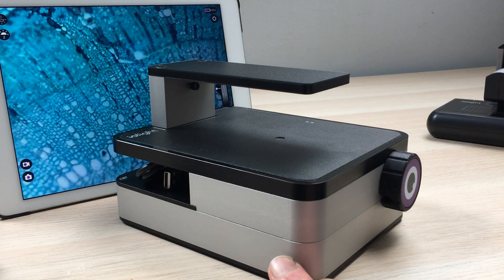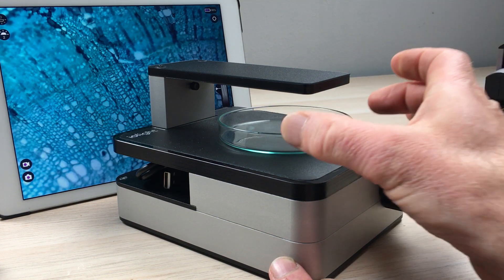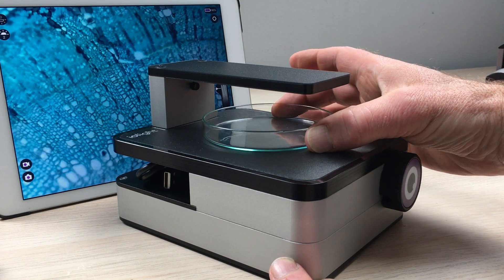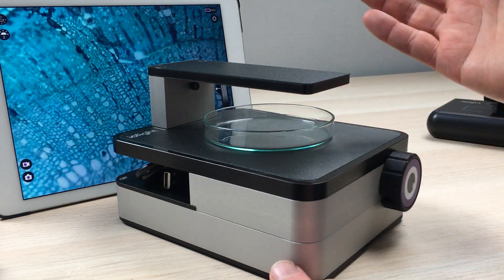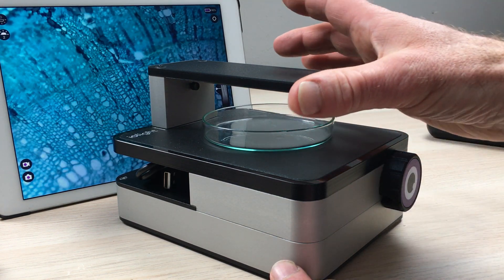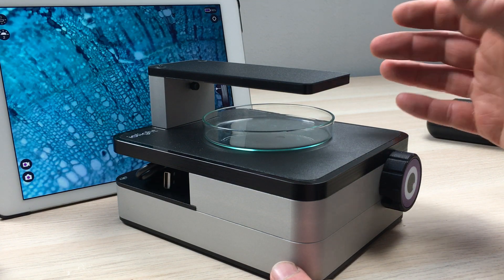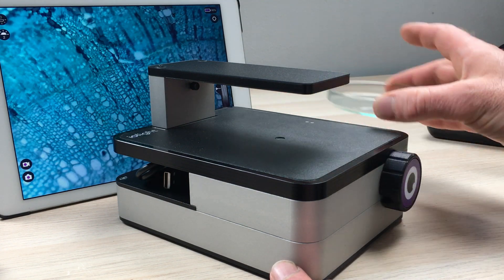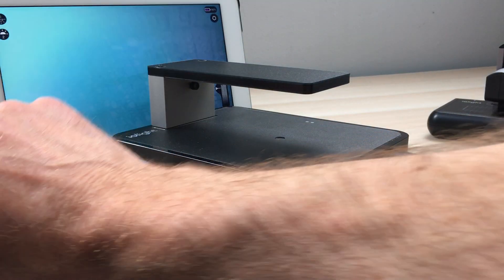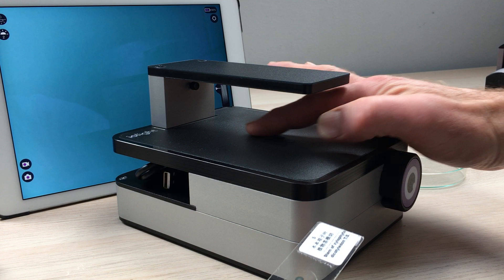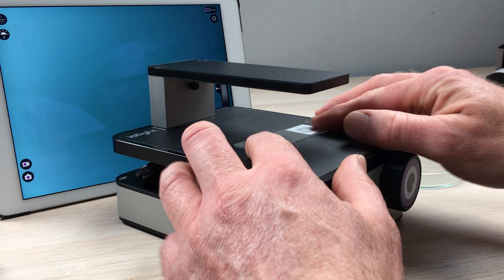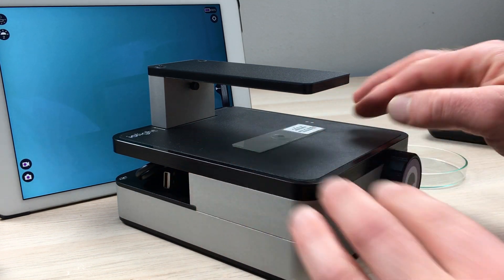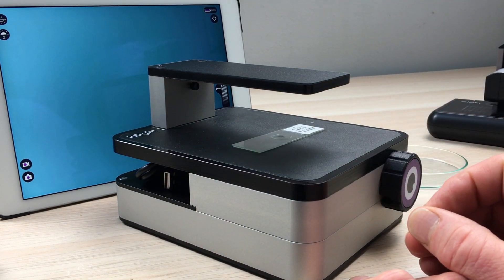This microscope is great for use with a flask or a petri dish where you might have a cell culture or embryos or maybe some pond water and other things like that. But it's also good as a demonstration microscope because you have a large flat surface and you can easily put a sample here and manipulate the sample.